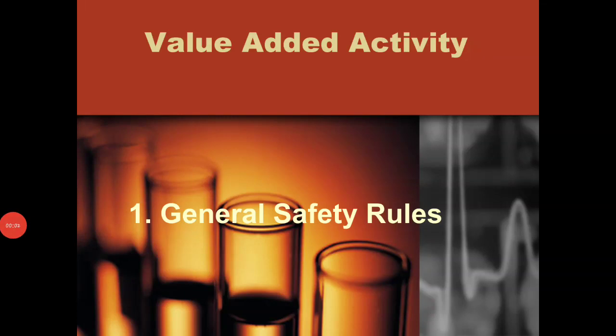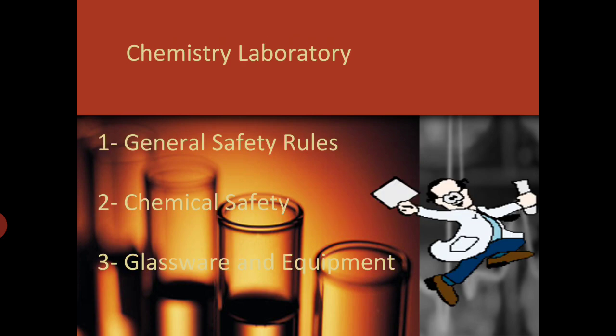Hello everyone, good afternoon. Today, in this session, I'll be talking about general safety rules, which is the small value added activity for you. Under chemistry laboratory, we have general safety rules, chemical safety, glassware, and the equipment safety.